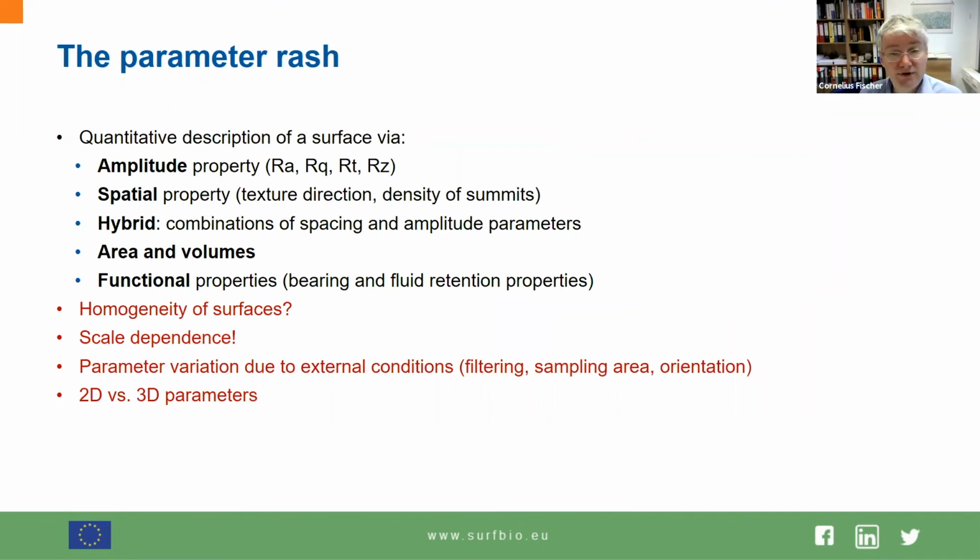comparability. So there are hundreds of surface roughness parameters around. I don't want to talk about them. There are a few groups available that you need to know if you want to apply them. We have talked about the amplitude, but there are also some spatial property analysis parameters available. But wait a second, it needs some information about periodically or non-periodically distributed surface features. And there are parameters that take direct quantification of surface area and volume portions of the topography.